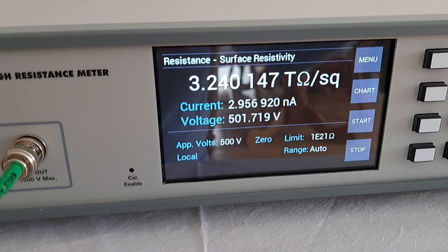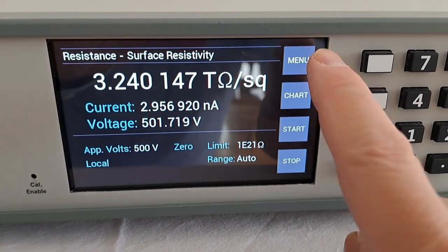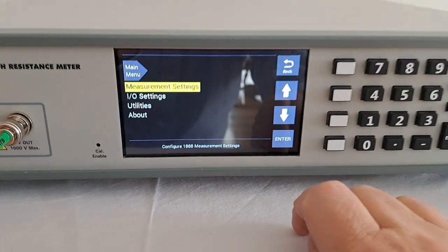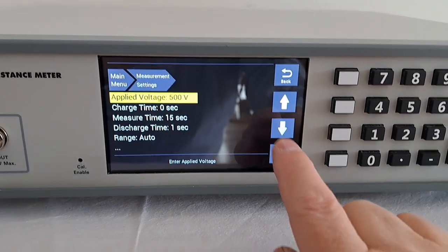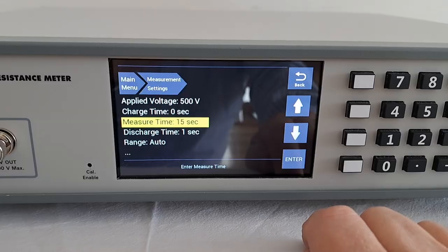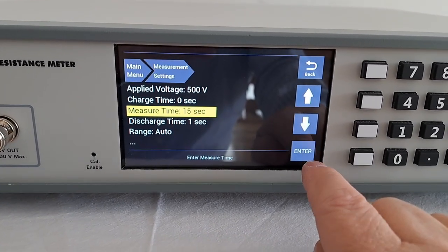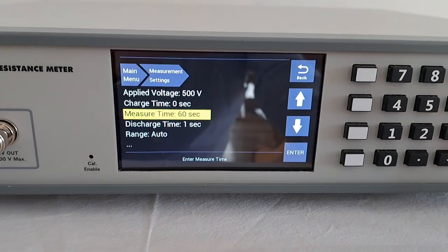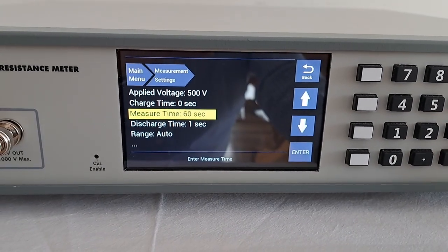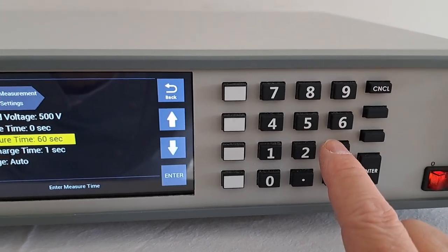From the menu on the 1888, you press menu — this goes to the regular menu. Press enter and you can change the voltage, going up or down. You can also change the test time, which would normally be something like 60 seconds, so all we have to do is enter 60 and press enter. You can use the soft keys or the numeric keypad, whichever you prefer.